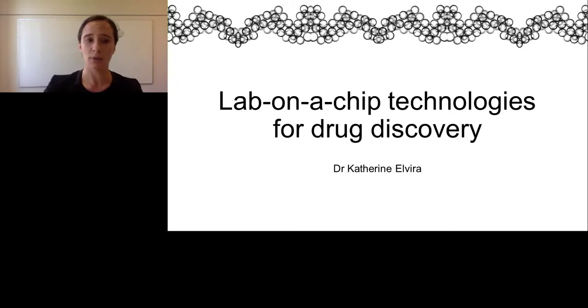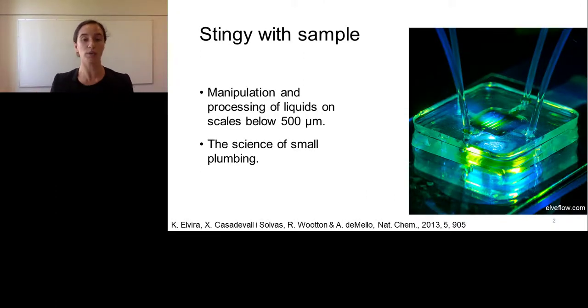So, today we're going to go over the basics of what microfluidics is. What is a microfluidic chip or a lab-on-a-chip? We're also going to talk about a specific subsection of microfluidics called droplet microfluidics. And then we're going to go into perhaps the more interesting side: how do we use these droplet microfluidic devices in the field of drug discovery.